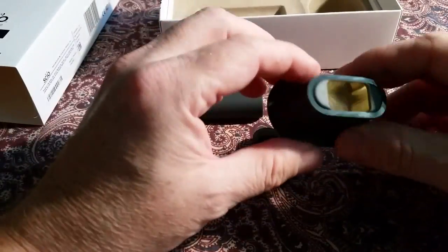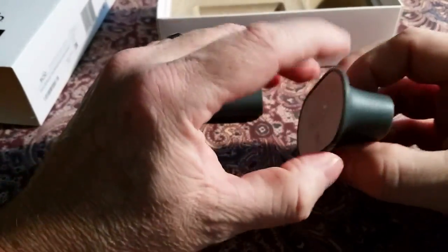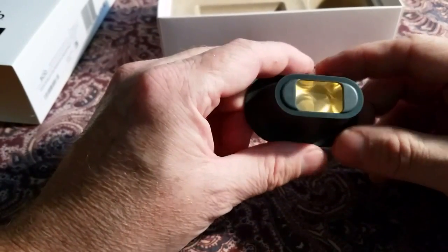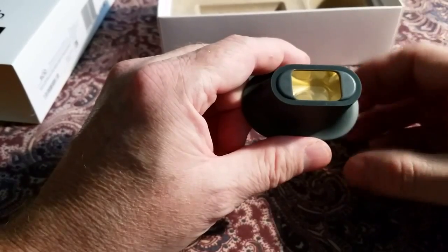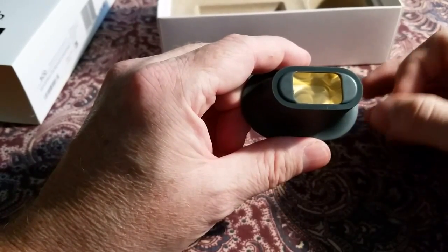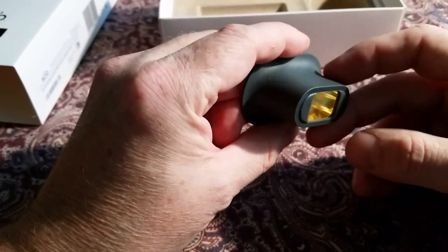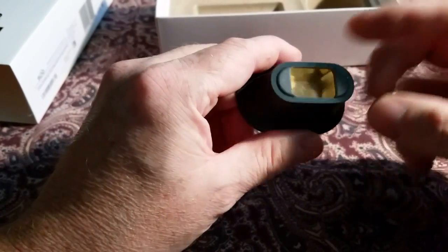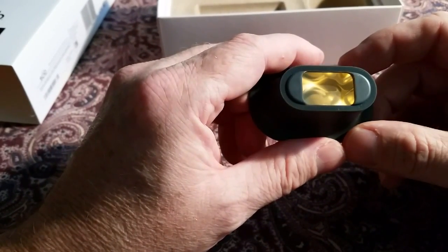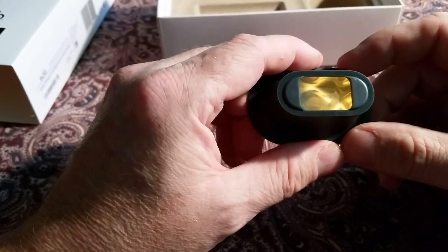The pill base works the same way — held on with magnets. It provides a cup area for you to put a pill, seeds, or something small — several similar items — so that it encases them and only what's inside gets scanned.